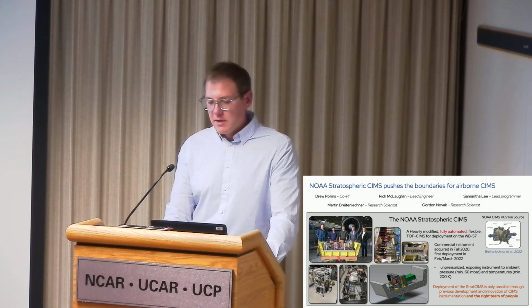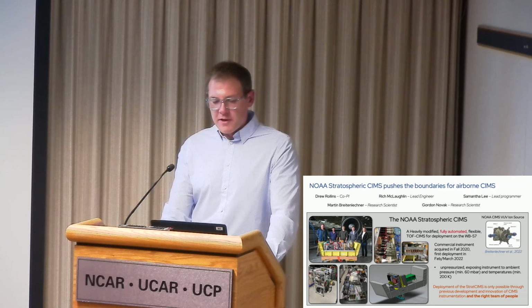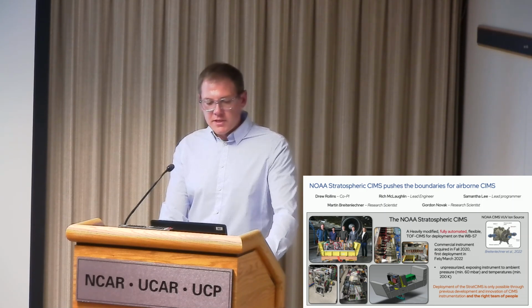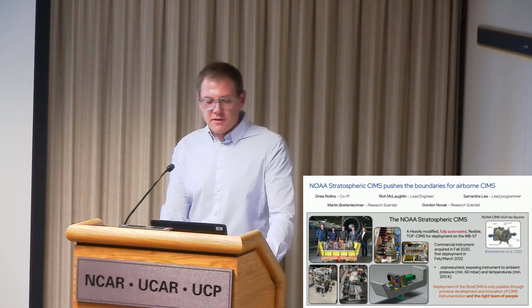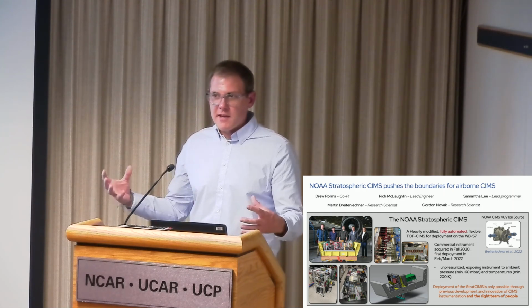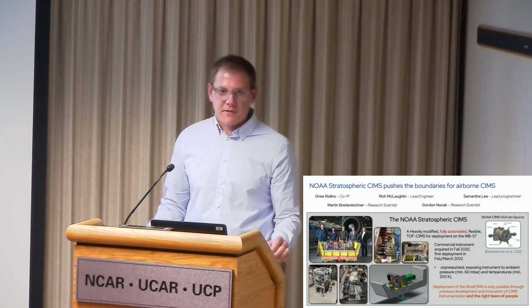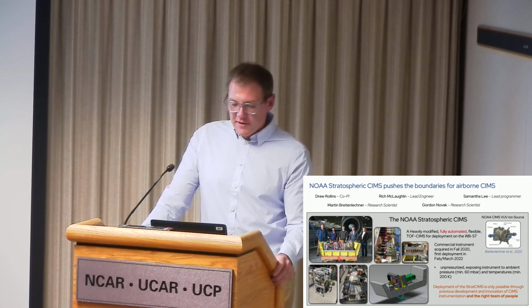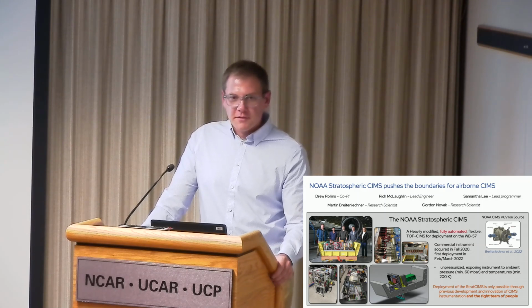So we teamed up to develop the CIMS methodology, but also the ability to fly this thing in a more elegant package that's flexible. You could take this out of this pallet and rack it in a normal instrument rack and fly it that way. If we put it in a can, you can't necessarily do that. That's a whole different engineering challenge. But ultimately, this is just still a series of boxes and cables.